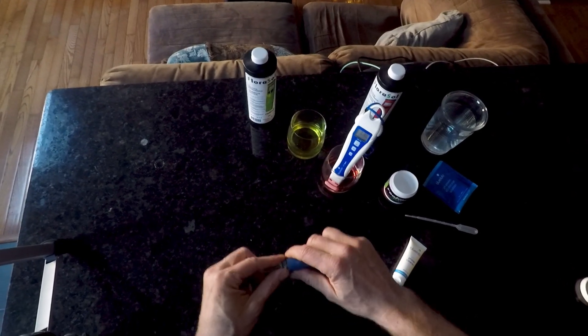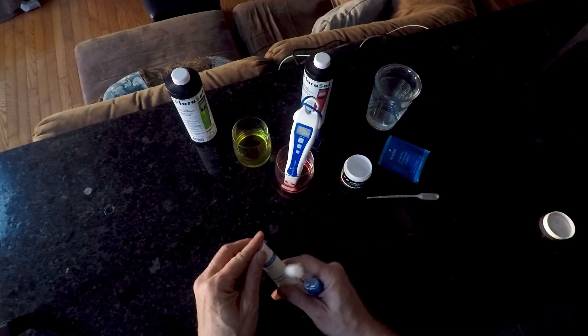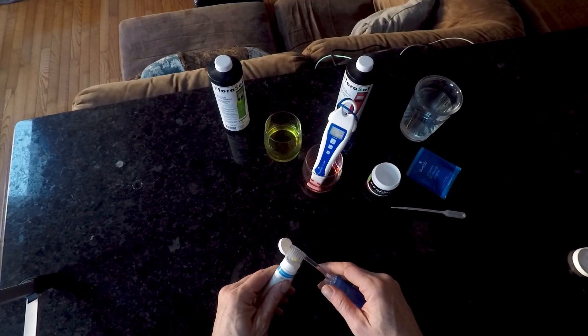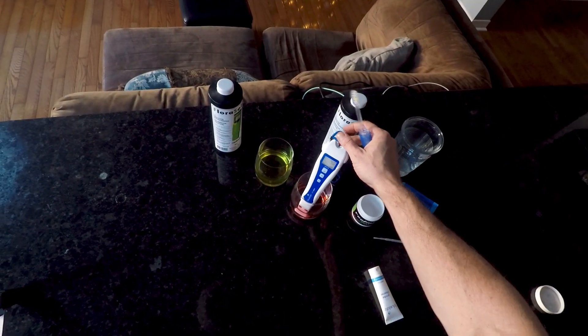Since we're doing this, we're gonna give it a little clean as well. We have a little probe cleaner that comes with the pen and a little toothbrush. There we go — 4.0. We're good to go.